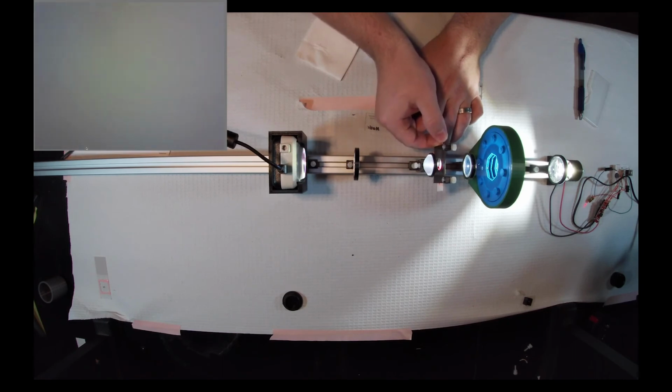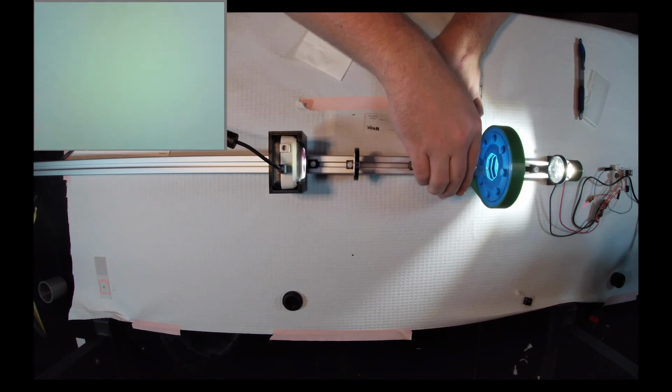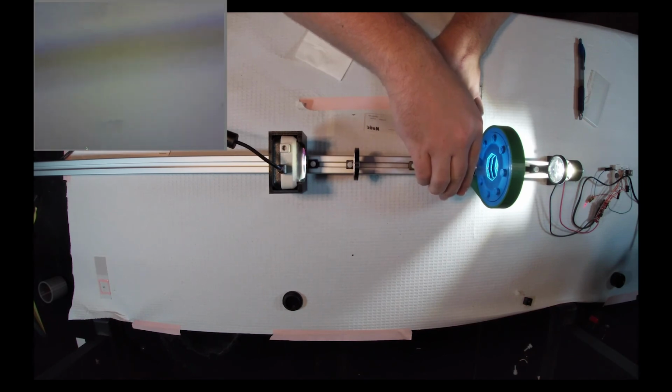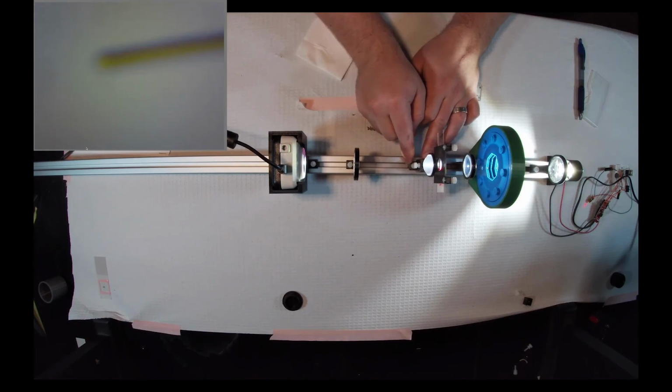And you can check out another hair, see if I can find another one in here. Yeah, so the edges will look a little bit darker than the middle. My hair is partially transparent, with a lot of crystalline protein structures in there.